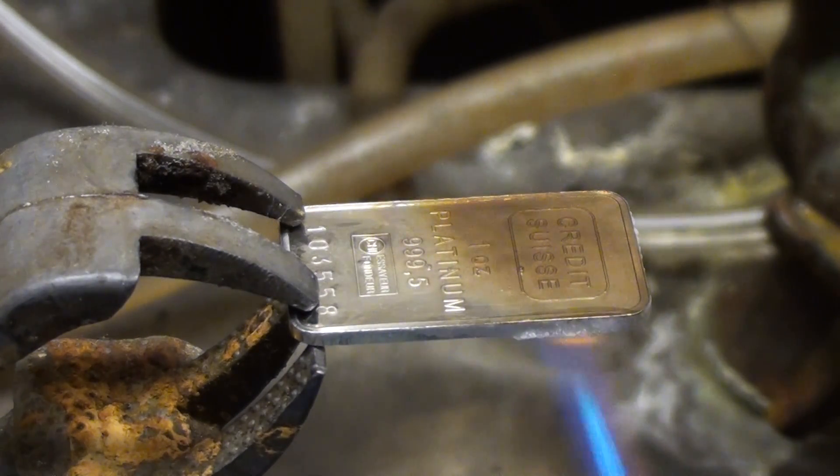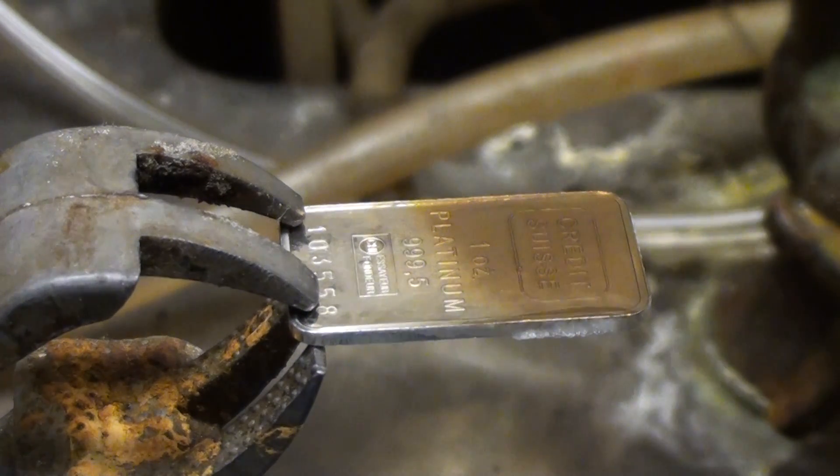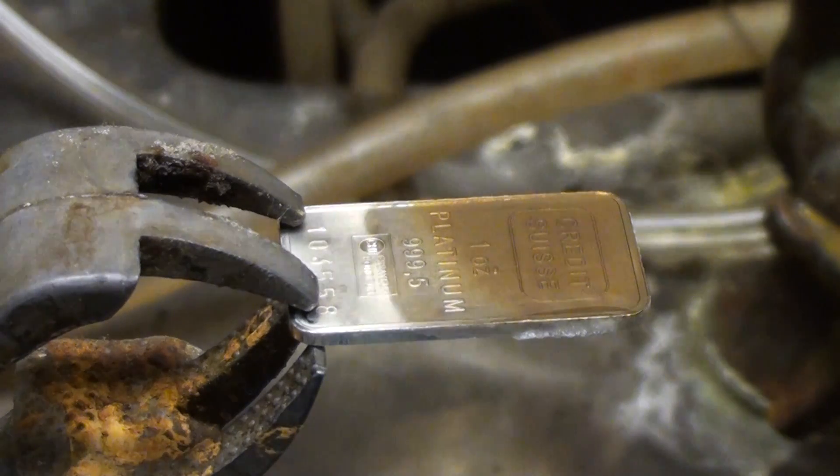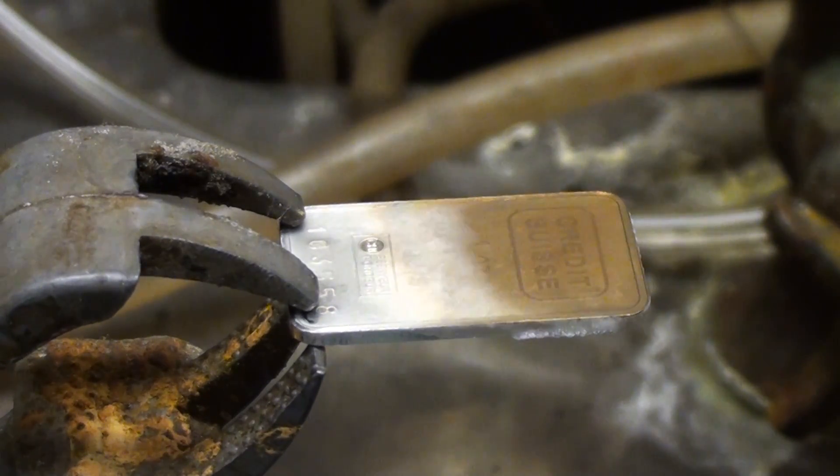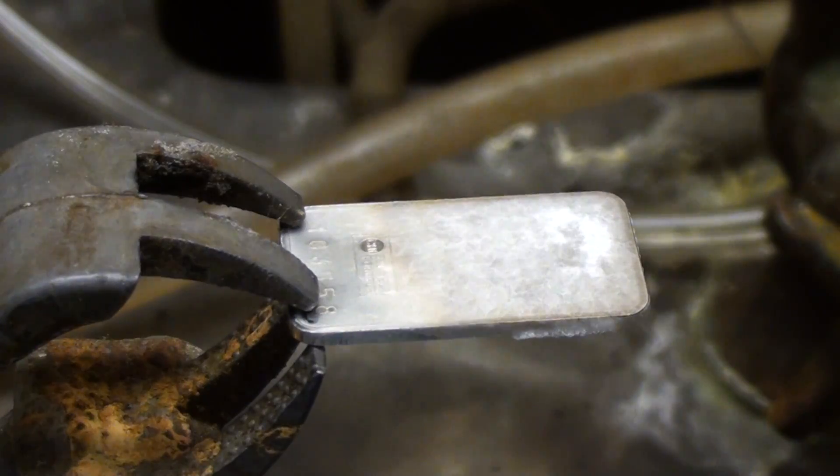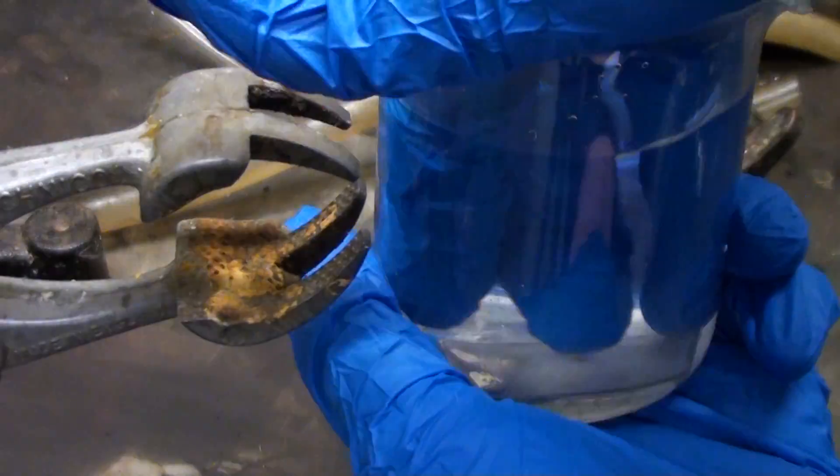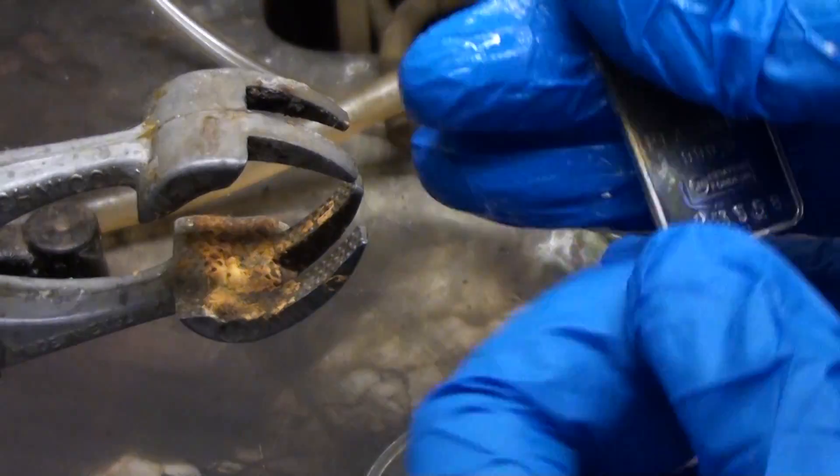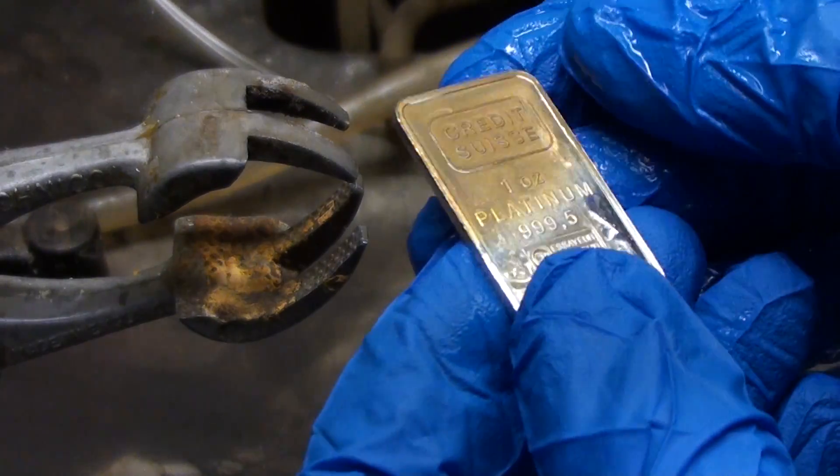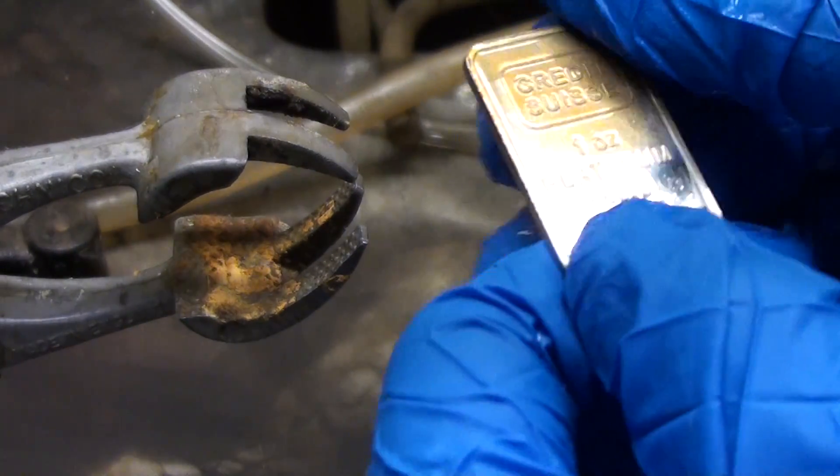Either the sodium hydroxide is turning brown or the platinum is. Let me let it cool and we'll remove the sodium hydroxide to be certain. The sodium hydroxide is solidifying so we'll need to dissolve it in water. Here we go, looks like the brown color is permanent. Platinum can be tarnished by molten sodium hydroxide.